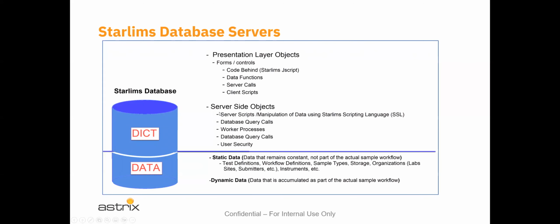Server-side objects also. The server scripts are there, manipulation of any data using STARLIMS scripting language. That's all done on the application server through the dictionary. Database query calls. We have worker processes, and we'll talk a little bit more about that as well.